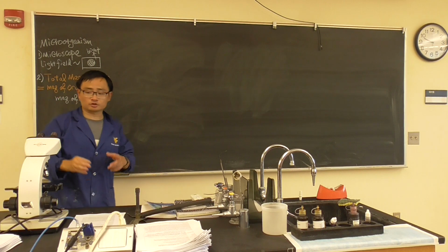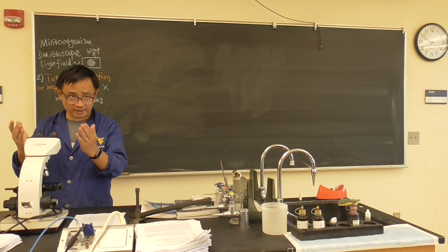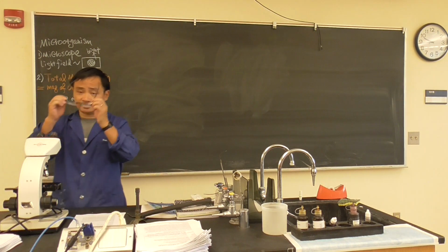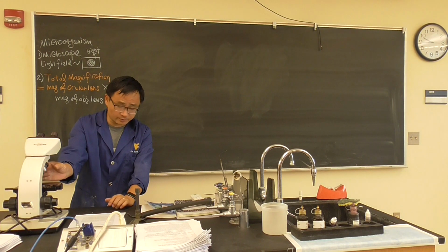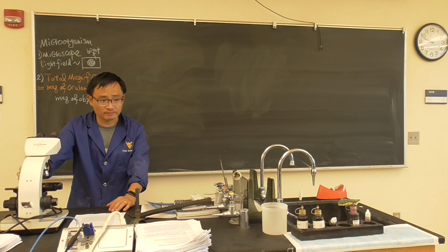So, where is ocular lens? The most expensive piece of a microscope is lens. Ocular lens, obviously, is close to your eye. Objective lens is down here. There is basically 4 objective lens. We're only going to use 2, or barely we can say 3 during the semester.